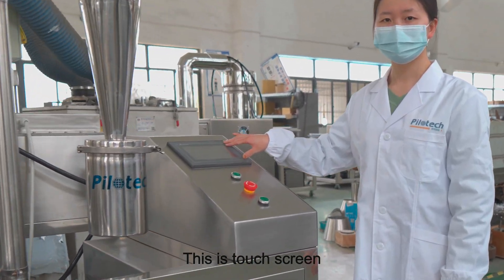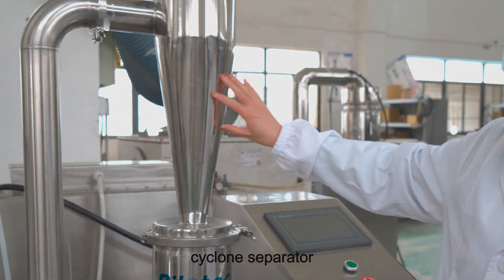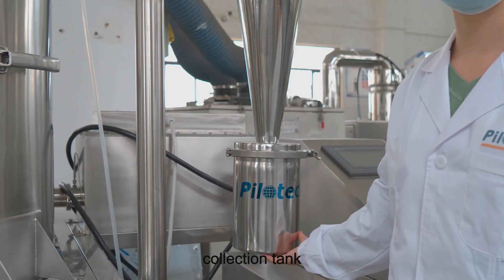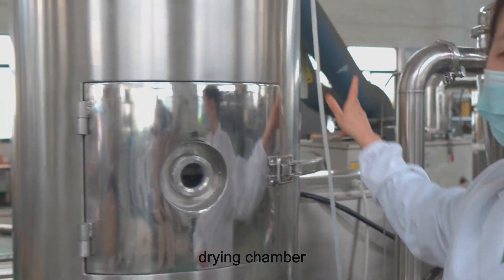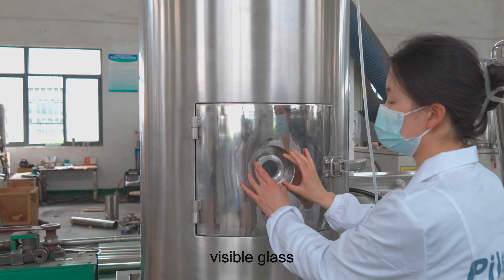This is the touchscreen, cyclone separator, collection tank, drying chamber, and visible glass.